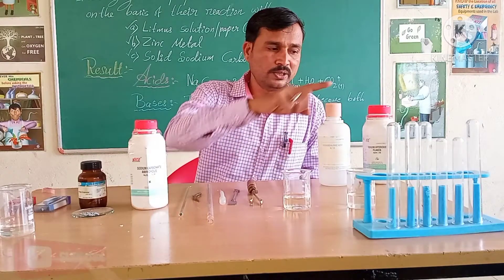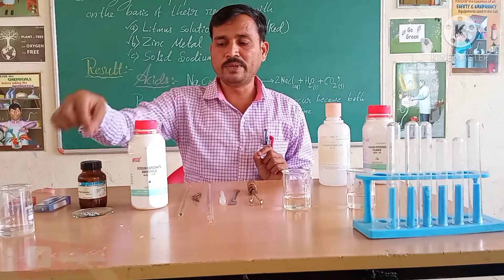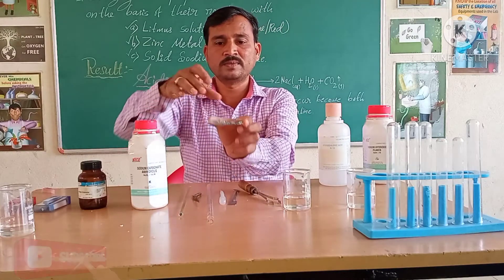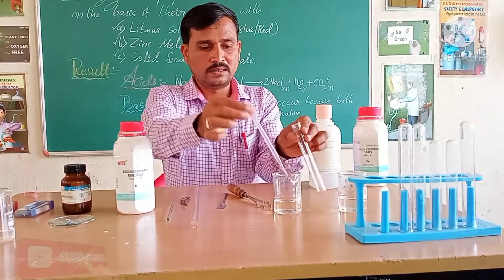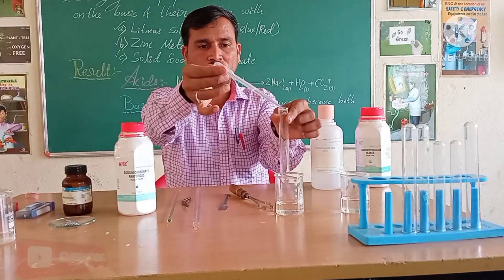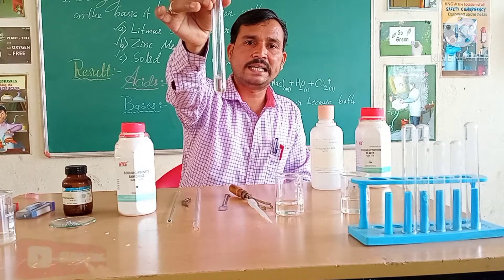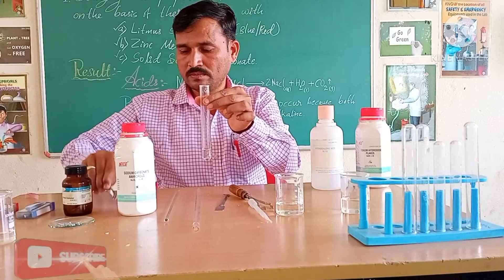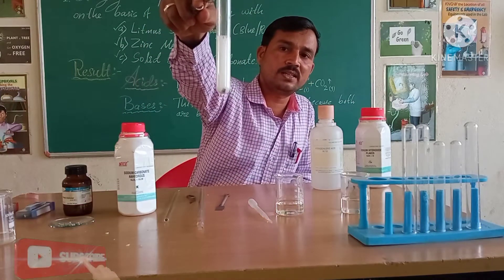Here the dilute hydrochloric acid solution and prepared sodium hydroxide solution are ready. We will take both solutions in small amounts in test tubes. I kept some zinc granules in the watch glass — you can see here, these are the zinc granules. I will take one test tube and add 10 ml of dilute hydrochloric acid, then add a few zinc granules.